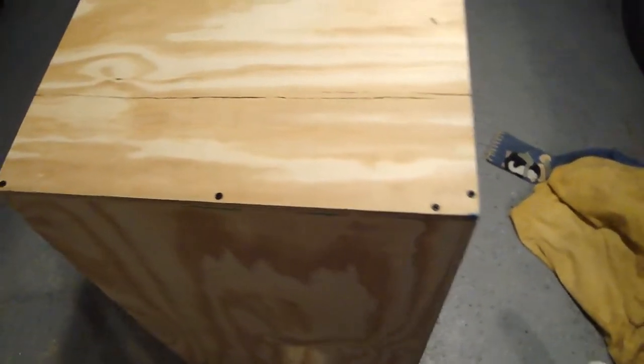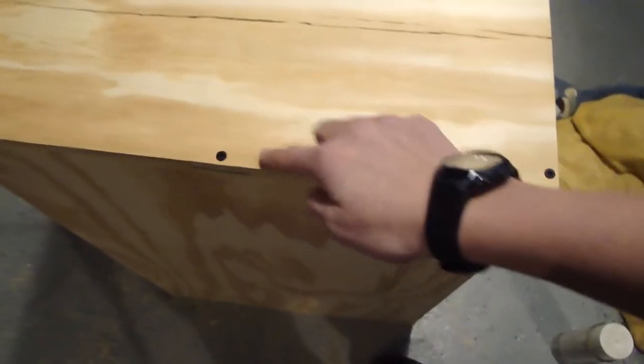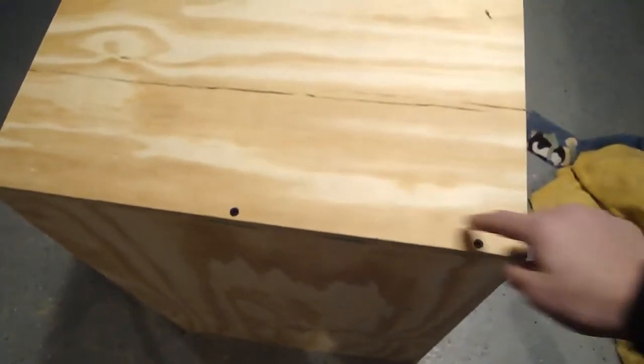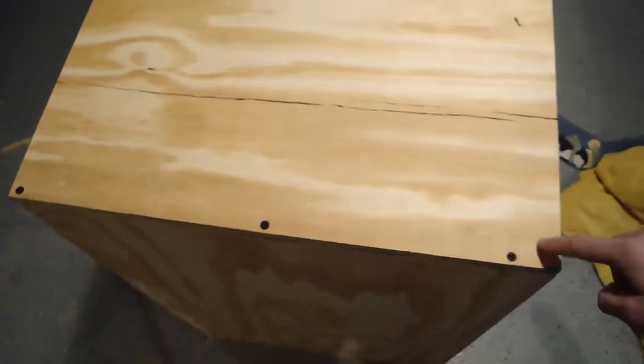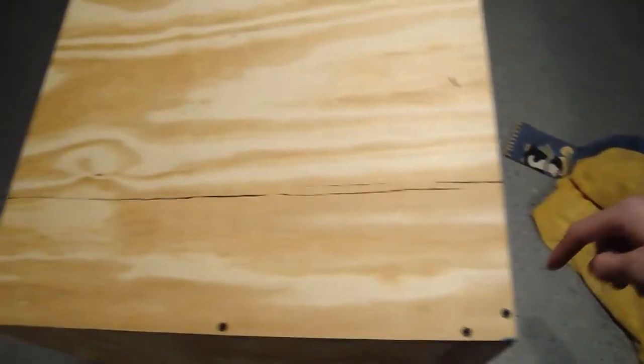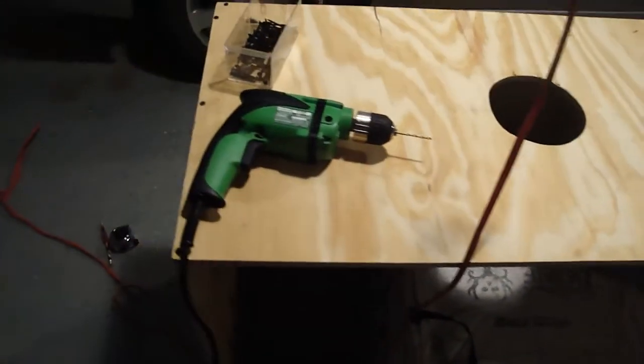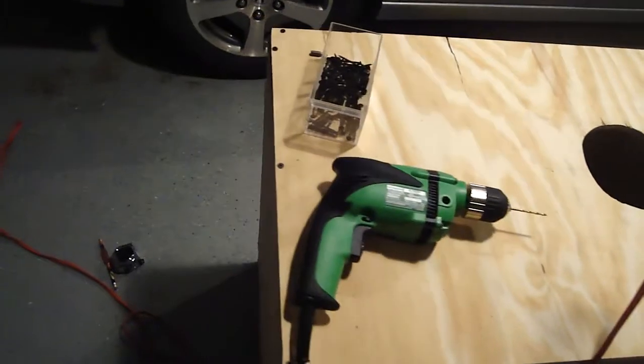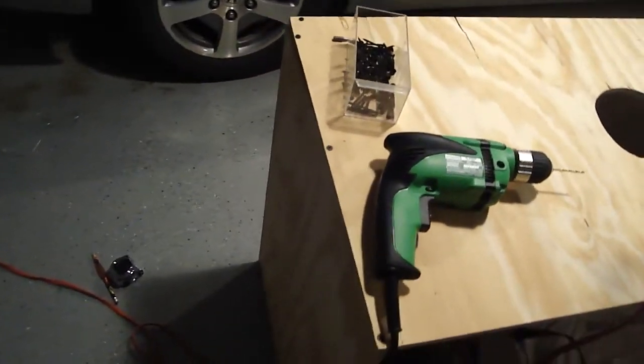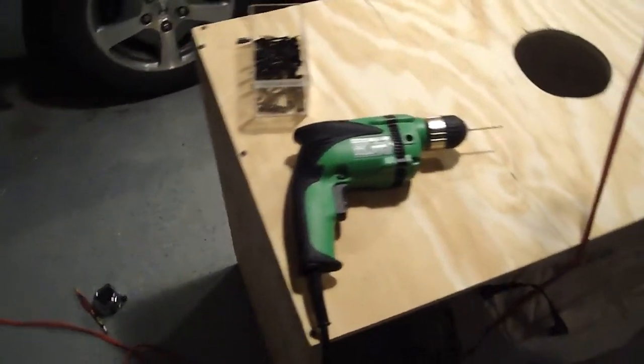So we finished up the sides here. We just put one screw in the middle too. That should be enough. I'll just go around it so you can see it so far. There's the hole in the center. That's what it looks like so far.